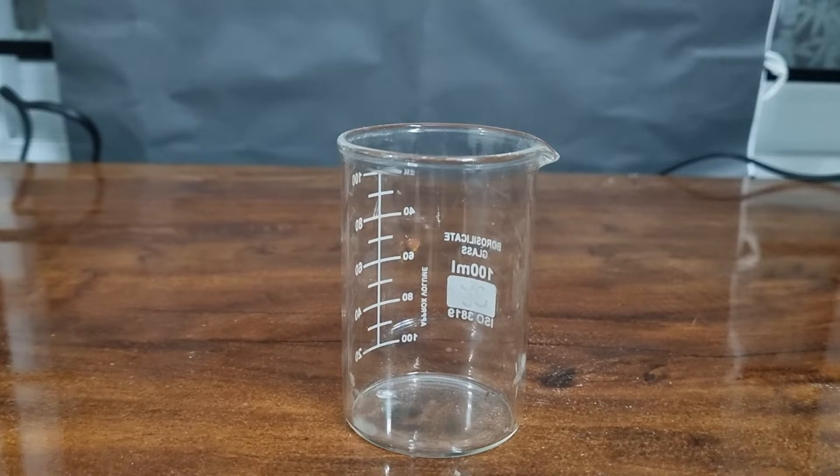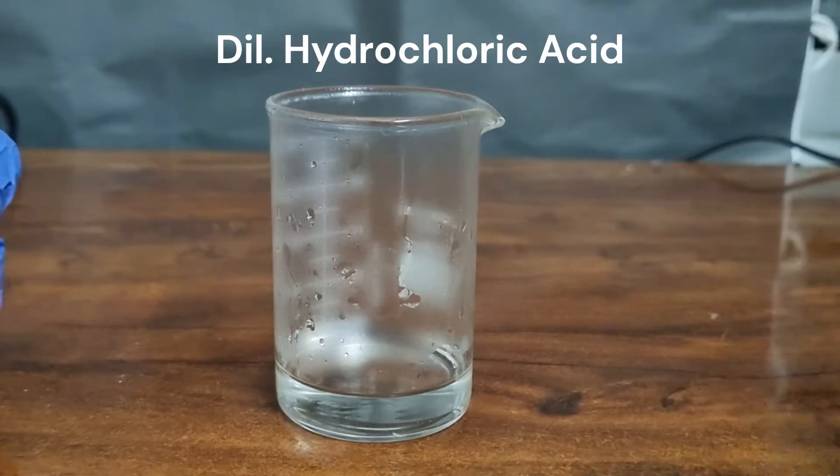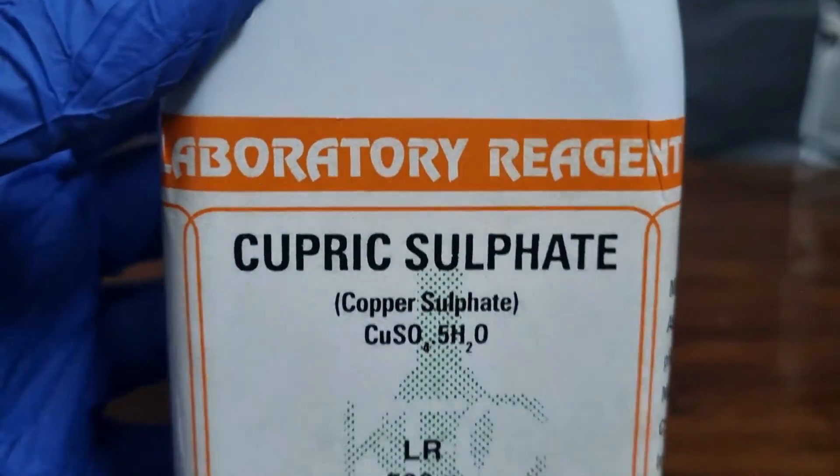Hey everyone, welcome back to my new video. In this video I'm going to show you the blue flame experiment. For this experiment, the first thing I'm going to start with is some dilute hydrochloric acid inside this beaker, and then the next thing I'm going to add is copper sulfate.